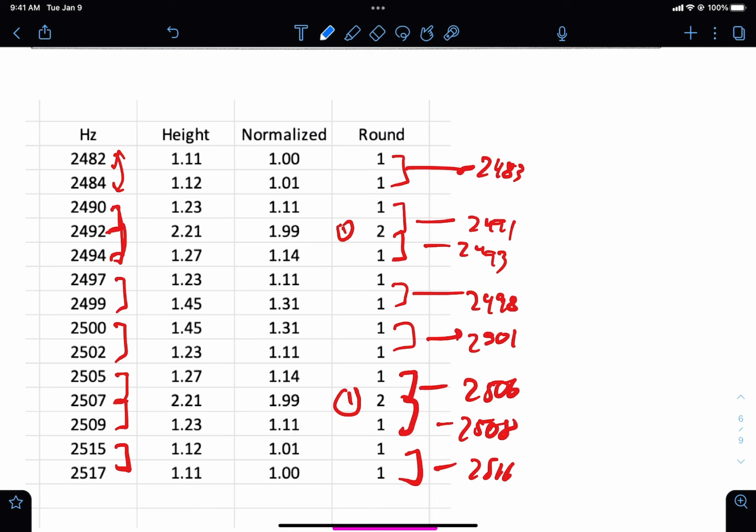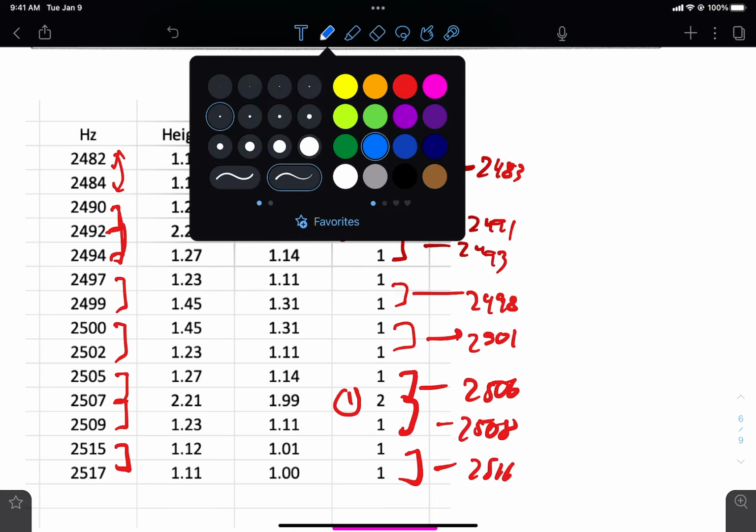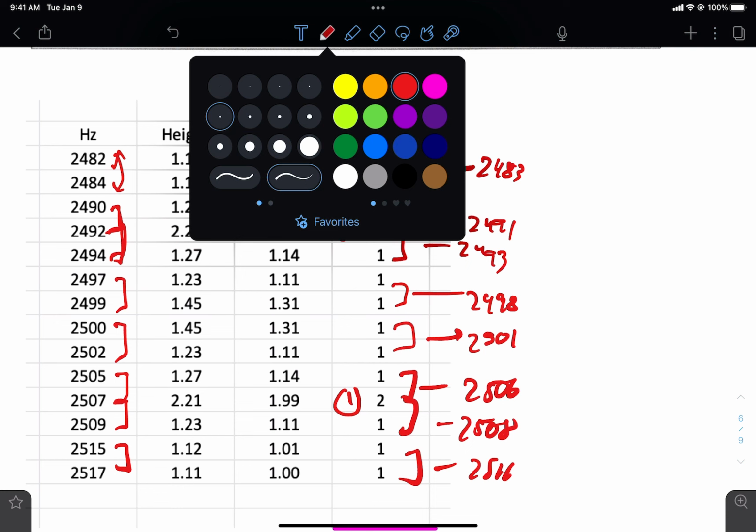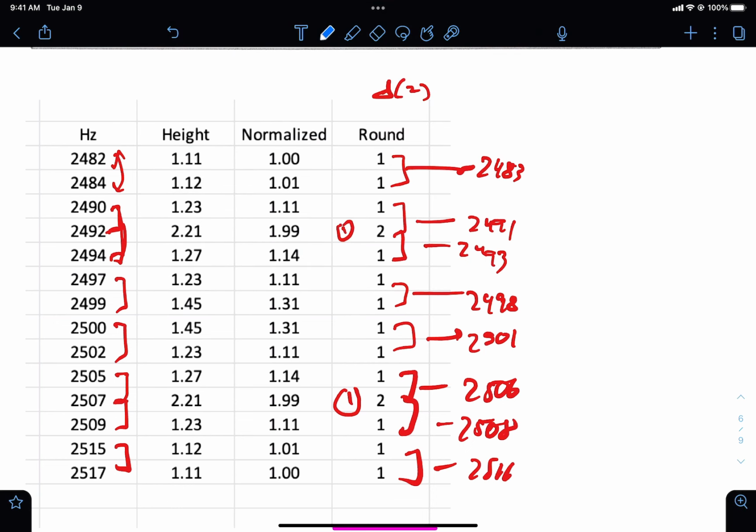So now what's our next pair? By the way, our first splitting that we disentangled was a doublet with a separation of 2. That's the first thing we did. So now what do our peaks say? Well, everything are 1s, so we have doublets all over the place here. Everything left is doublets. And our separation is 8. Okay, the top 2 numbers in our list are now 1 to 1, and they are separated by 8. So let's find all 1 to 1 separations of 8.